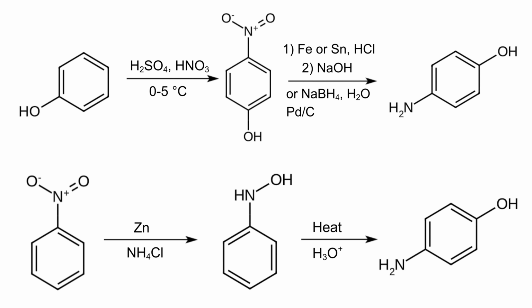The first step is to add the tablets into a beaker. I got 59 tablets of 500 milligrams each, corresponding to a total mass of 29.5 grams of paracetamol. Put the tablets in an adequate round bottom flask. In it must fit all the methanol. In my case, it was 455 milliliters.